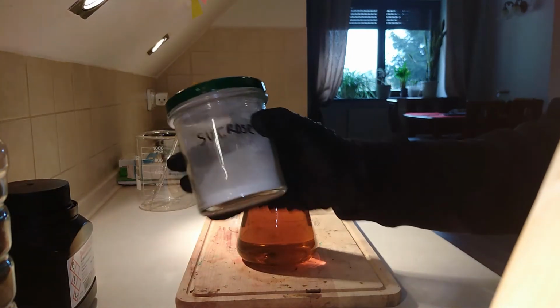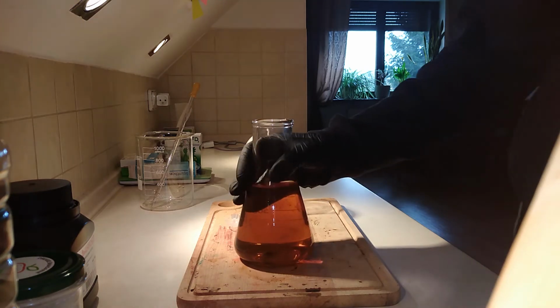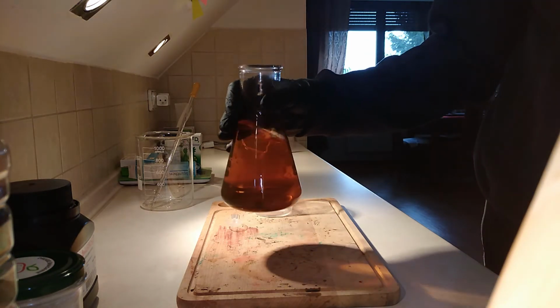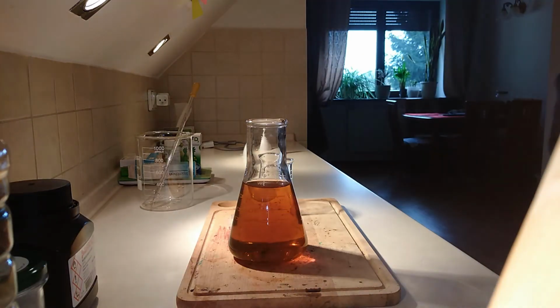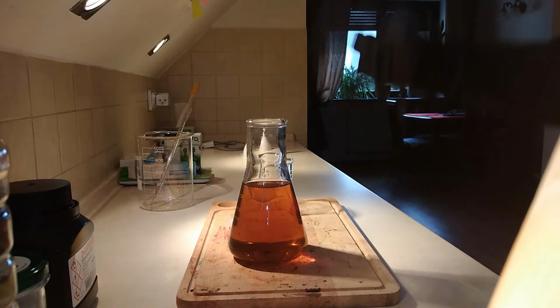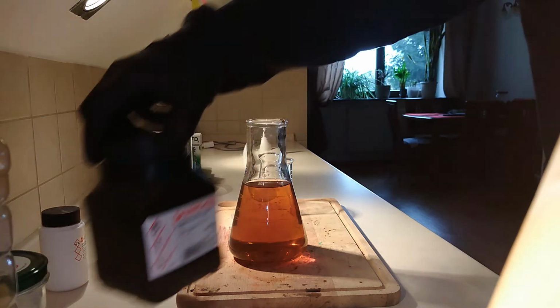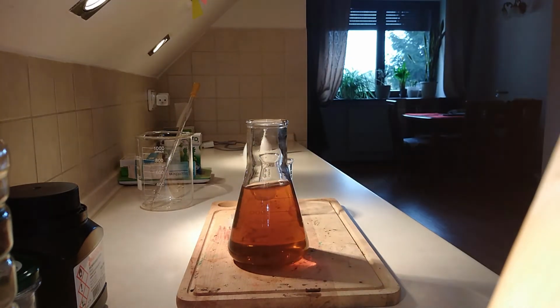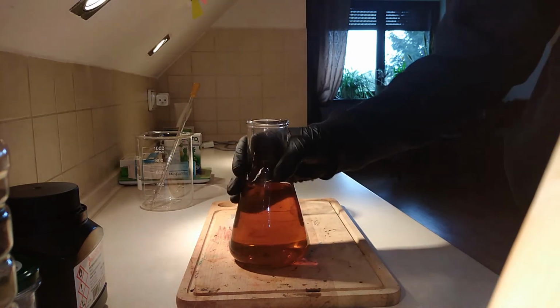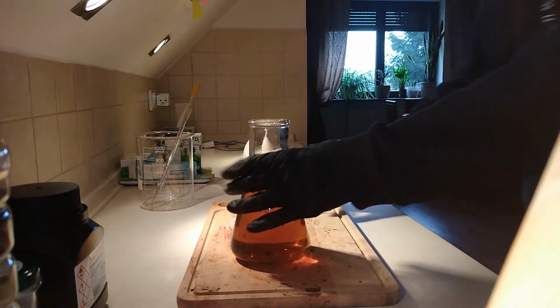In the meantime, sucrose gets oxidized, but it doesn't really mean anything for the colors. So it's definitely less interesting, and organic chemistry with saccharides, sugars, is higher level. So it was easier to explain with the manganese. Plus, it shows you some really nice colors. So this is the reaction. It didn't turn red, sadly, but it's a really nice reaction.